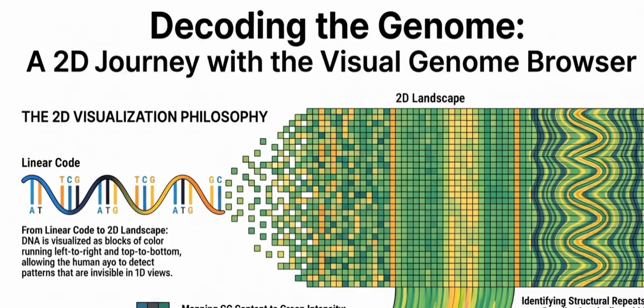Yeah, because you can zoom out and literally see these glowing, dense green bands where the physical DNA is tightly bound, and they're separated by dark voids where it's mostly looser A and T pairs. Right, so you have established the terrain. The one-dimensional string has basically been wrapped into a two-dimensional tapestry of structural density. But of course, a map is only useful if you possess the tools to navigate it. Exactly. Let's explore those tools.